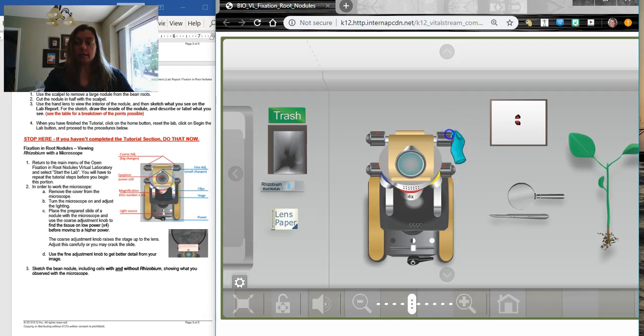So when I click this, I have to hold it with my left mouse button, and then I can scroll up and down with my right, or move your mouse. You might want to take a minute to make sure you can in fact do that. Now watch the little red dot.